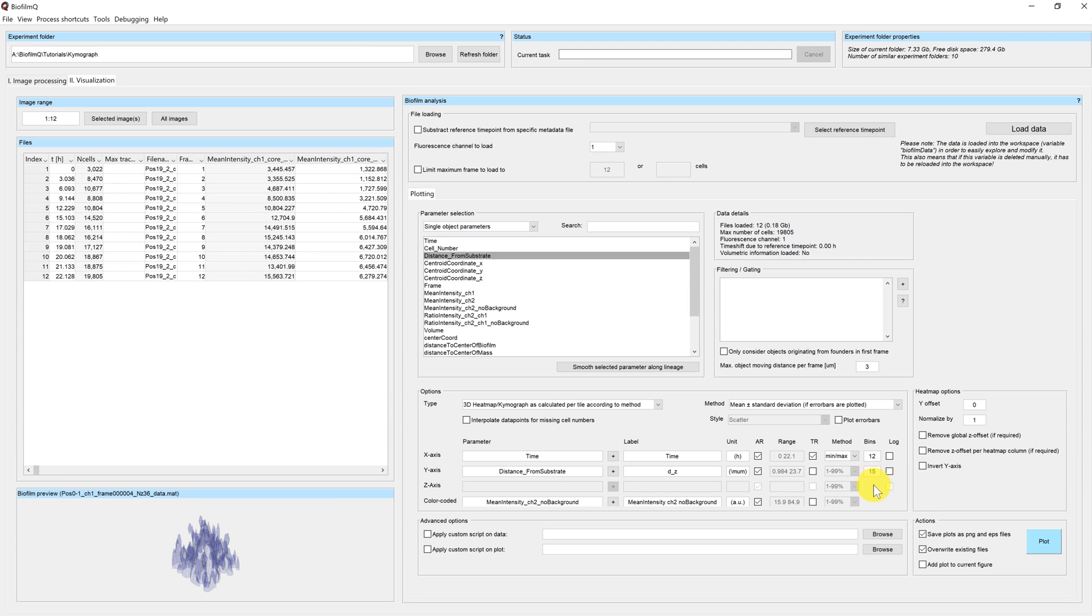If you want to learn more about choosing the proper bin size, you can watch the histogram tutorial in which this is explained in more detail.